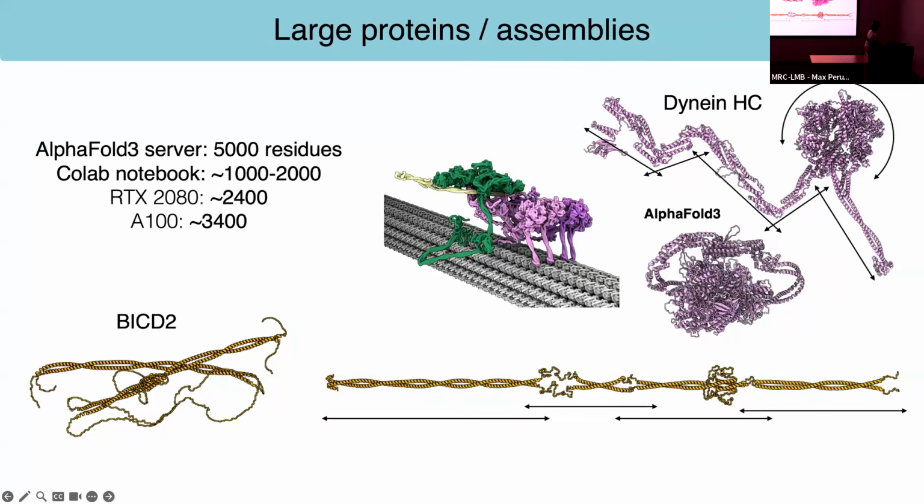But for this kind of thing, I was stitching it however I could, and then using the cryo-EM density to further relax things into the density. And the combination of those two things gives you something that hopefully is accurate, that you can then interpret.